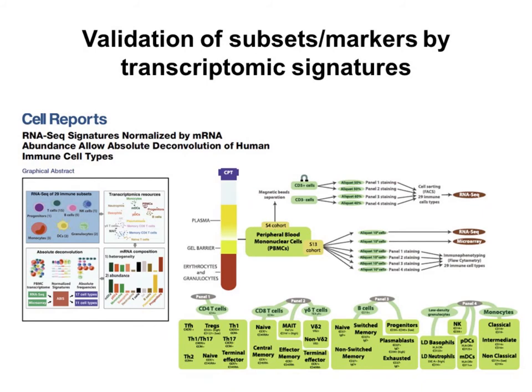This was the aim of this paper, but it also enables us to see how the selection of markers for the identification of populations ends up with the right population, because while a CD4 is easily identified as a CD4, in other subsets sometimes you may have overlap. As the aim today is to have a consensus, there are probably other ways you can get a consensus of which markers you select.